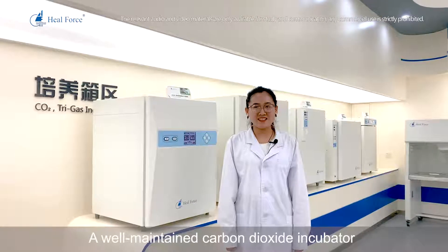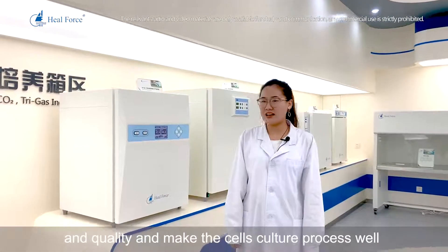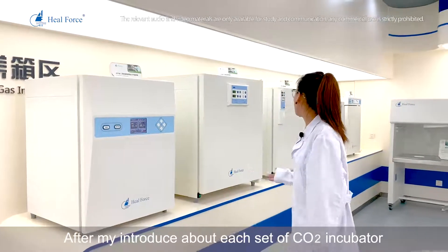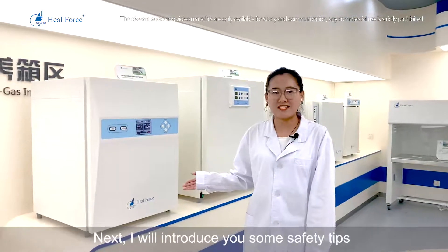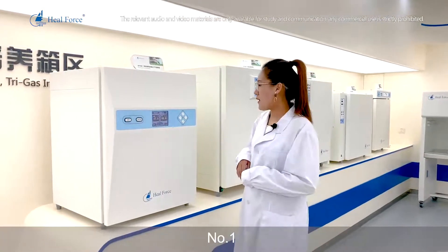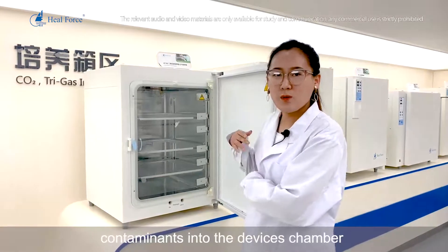A well-maintained carbon dioxide incubator will ensure the integrity and quality of your working process and support successful cell culture. Let me introduce some safety tips for your working process. Number 1: while working, never leave the door open, because this will bring room contaminants into the device's chamber.